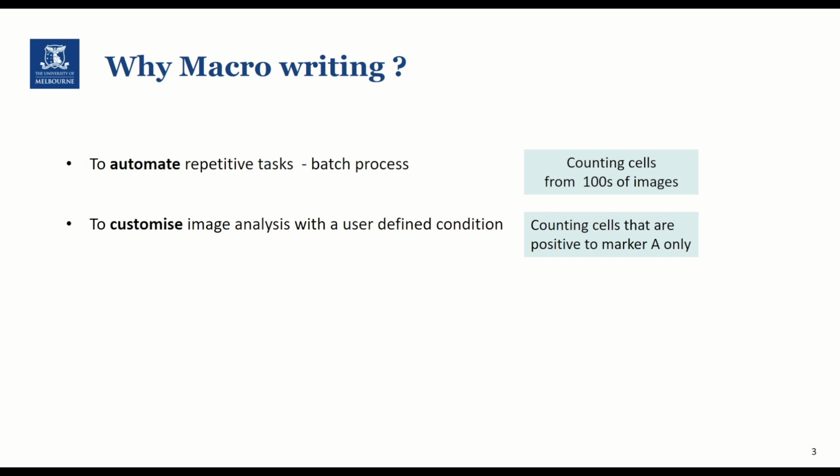Second, we can also customize our image analysis workflow further. For example, if we want to count the cells that are positive for another marker rather than every cell, we can set up such conditions using the macro language.